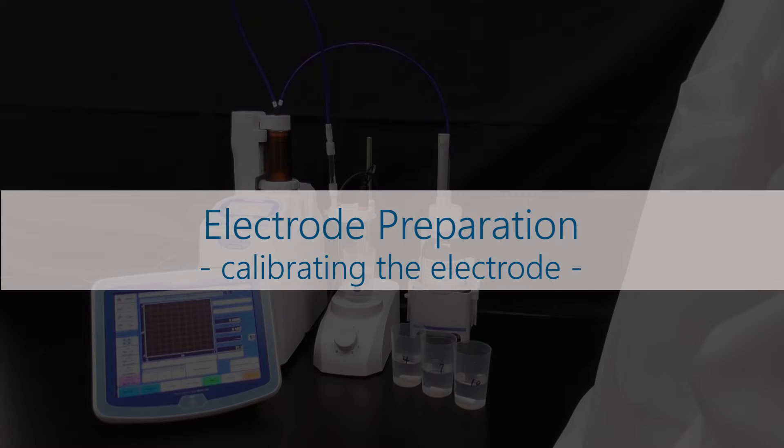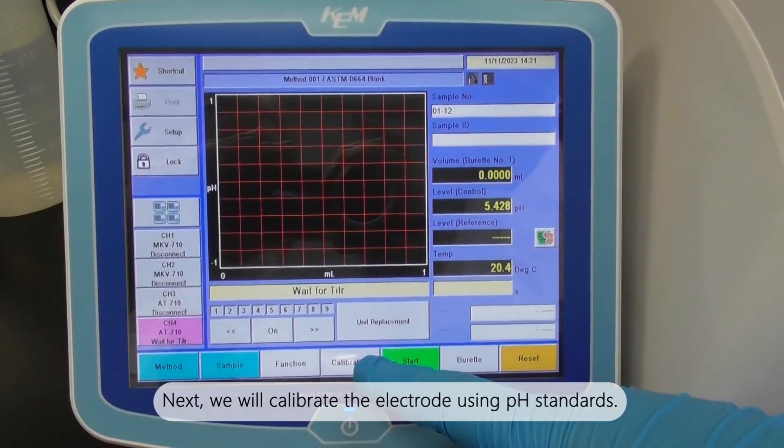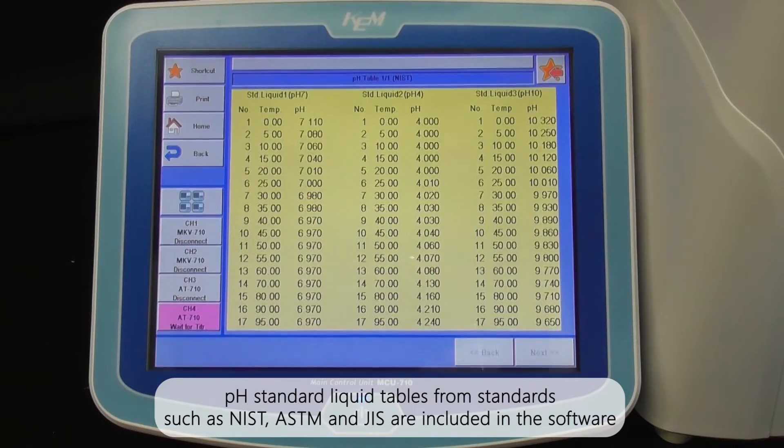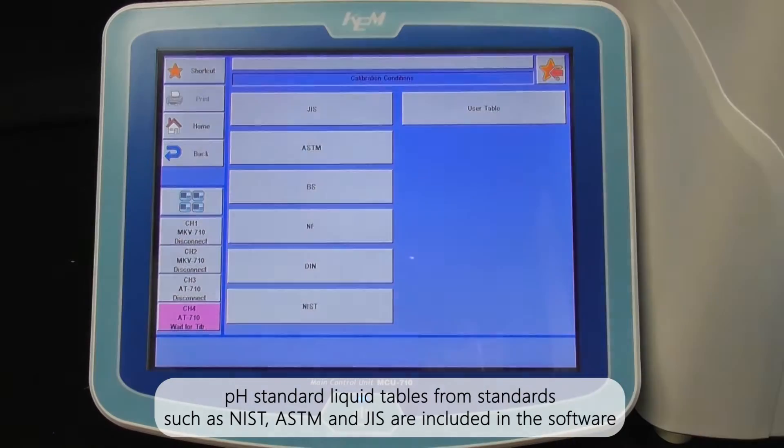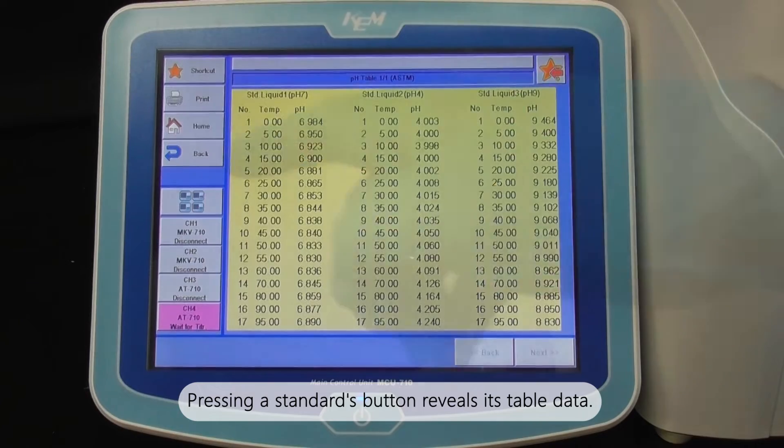Electrode preparation: Next, we will calibrate the electrode using pH standards. pH standard liquid tables from standards such as NIST, ASTM and JIS are included in the software. Pressing a standards button reveals its table's data.